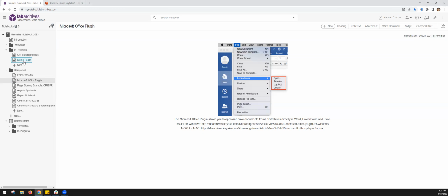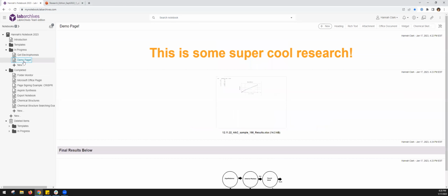Excellent question. And good to see that you're thinking the long term. You'd be surprised how many researchers don't think that far out. So when the file is right here, I have uploaded this file to LabArchives. It is stored within the LabArchives notebook. So it doesn't really matter about your local license, whether it's expired, discontinued, unsupported. We will continue to store that file, even if it's some weird proprietary file format or whatever it may be. We will continue to store that file.